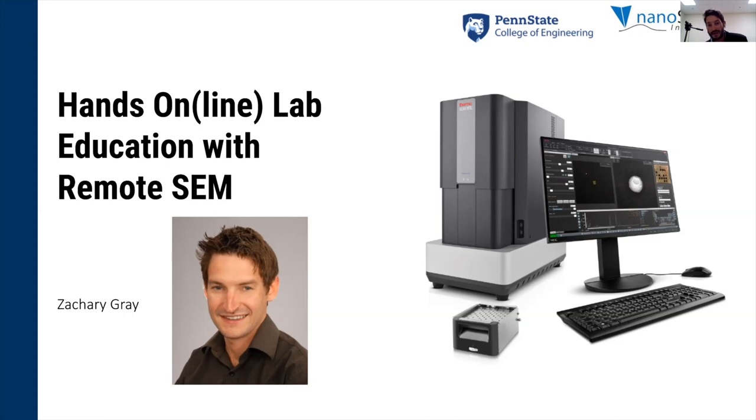I want to talk to everyone today about the remote access of the scanning electron microscope, along with just the scanning electron microscope in general as a technique, and why it's important, I think, for students to get this as an experience and a skill set.